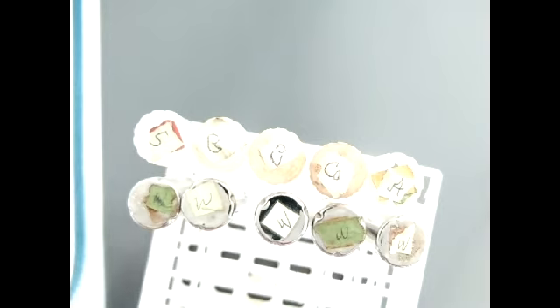So I will go and look at this chart, and the substances tested are going to be starch and water for the iodine test, glucose and water for the Benedict's test, corn oil and water for the paper spot test, which does not need the test tubes, corn oil and water for the Sudan test, and albumin and water for the Biuret test.